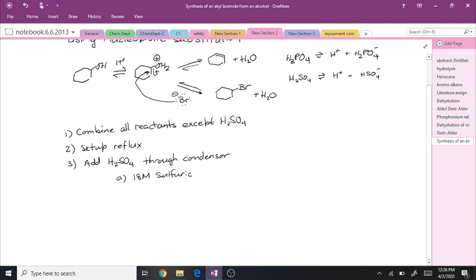And the acid has a high heat of dilution, meaning that when we add the sulfuric acid to our reaction mixture, the mixture is going to get fairly hot. If we simply poured it in, there would be the risk that we might heat and get some boiling, at least localized boiling, and have some of the acid splash out. And we want to minimize the risk of that.